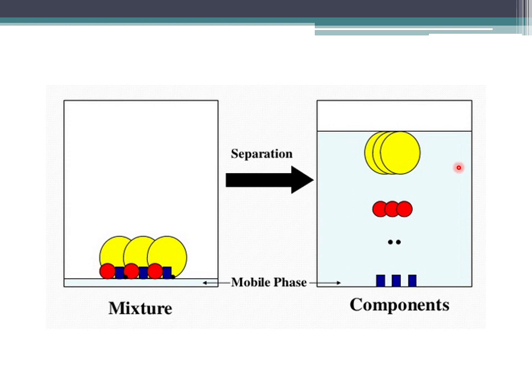So, berlakulah separation seperti ini. So, maksudnya yang lebih atas tu maksudnya dia adalah lebih soluble dalam eluent dan juga dia kurang absorb oleh stationary phase. So, ni berlaku separation. Okay. So, kita dapatlah kat sini after the separation berlaku molekul-molekul atau komponen-komponen tu telah pun diseparatekan, telah diasing-asingkan seperti itu.